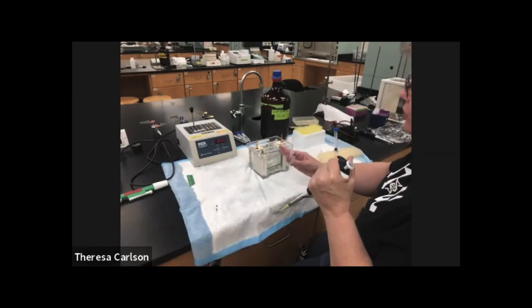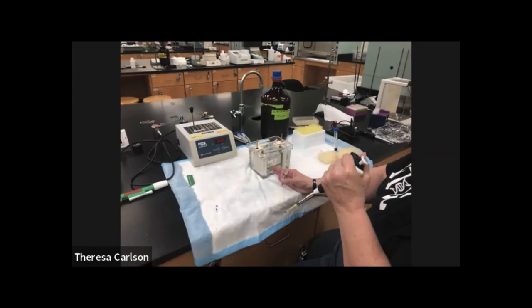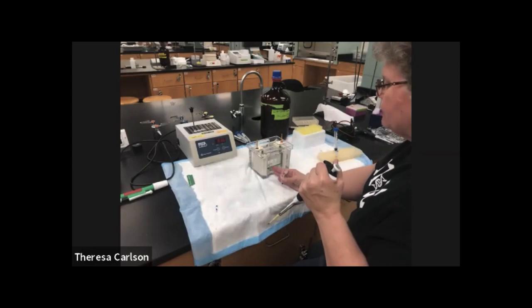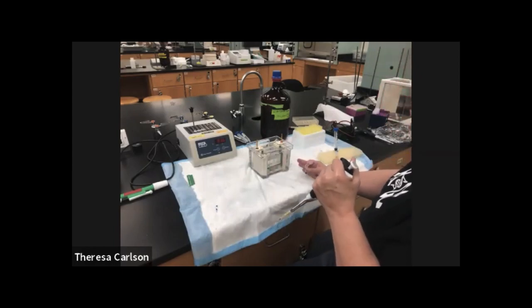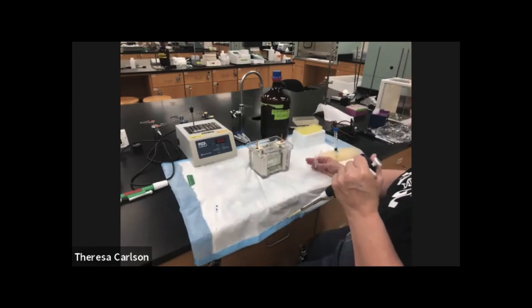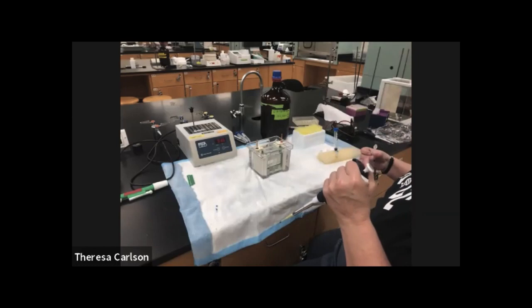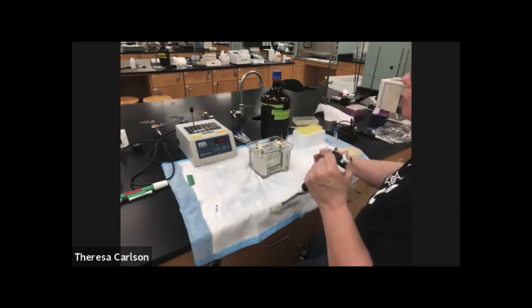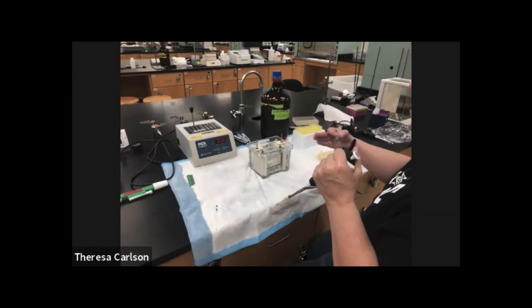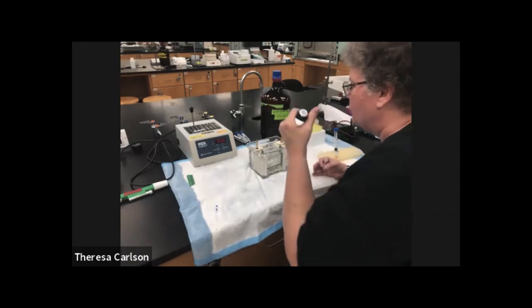And we're doing this because half of our gel, we're going to stain with Coomassie blue to show up all of the proteins. So Coomassie blue stains every single protein. The other half of the gel, the second S1, S2, S3, S4, marker, we're going to be putting into an immunoblot to react it with the antibodies and show you that, you know, you might have had a whole bunch of lanes of protein, but this is the one lane that is important. This is where your aldolase really was among all those proteins.